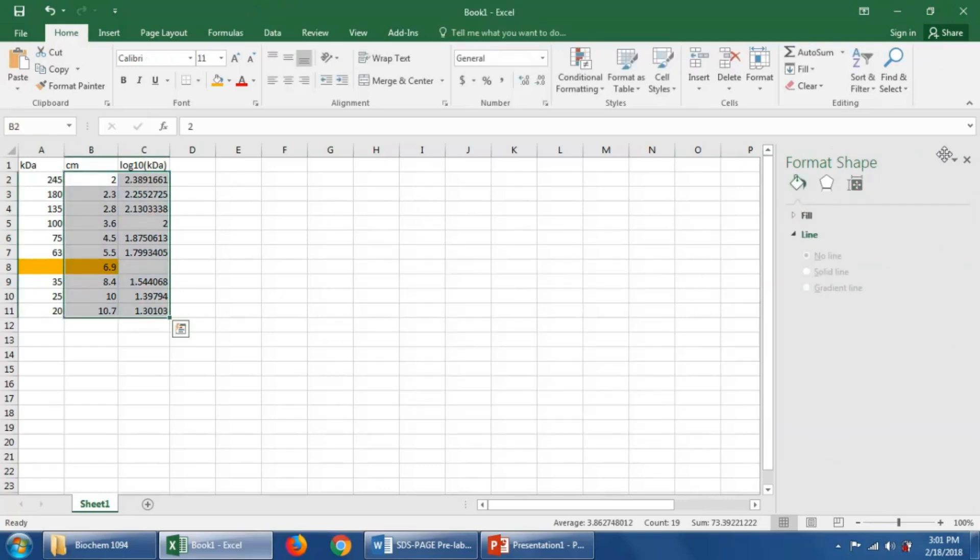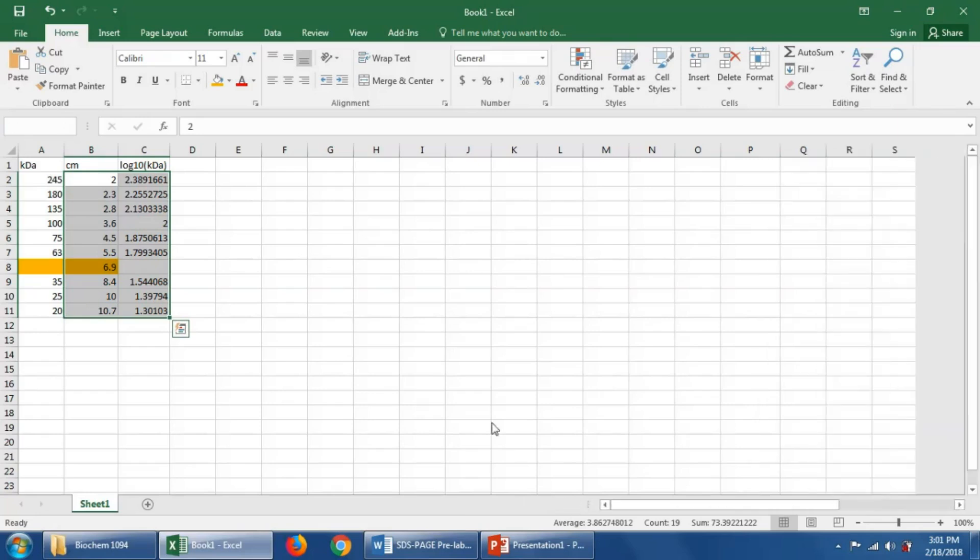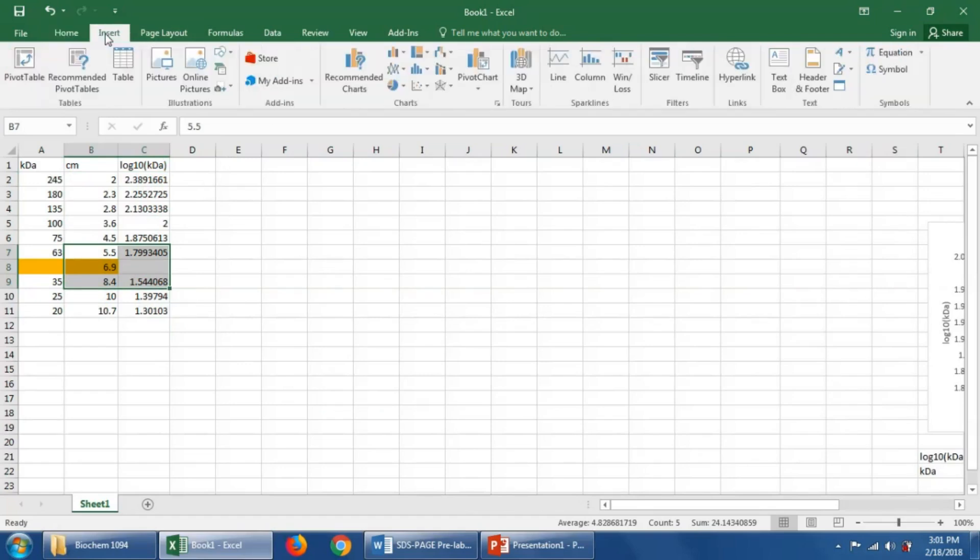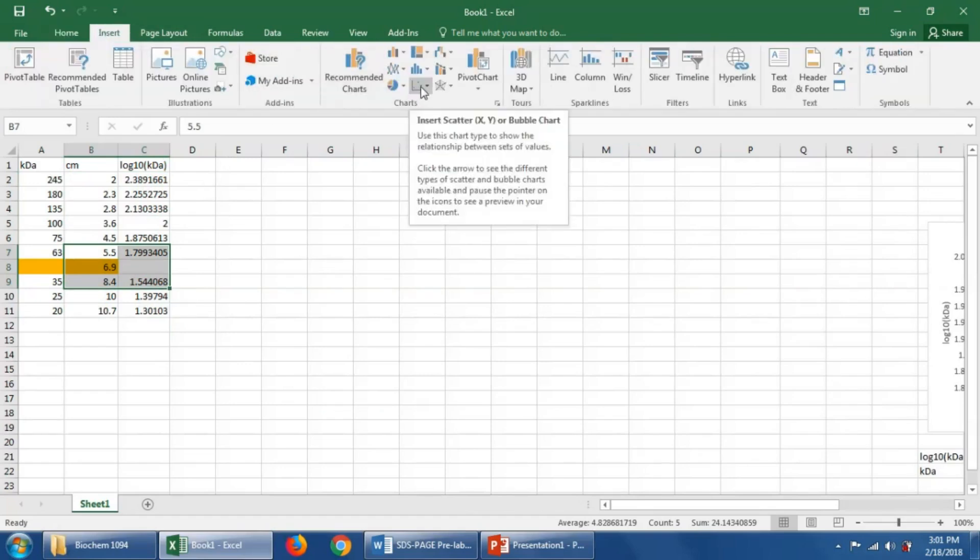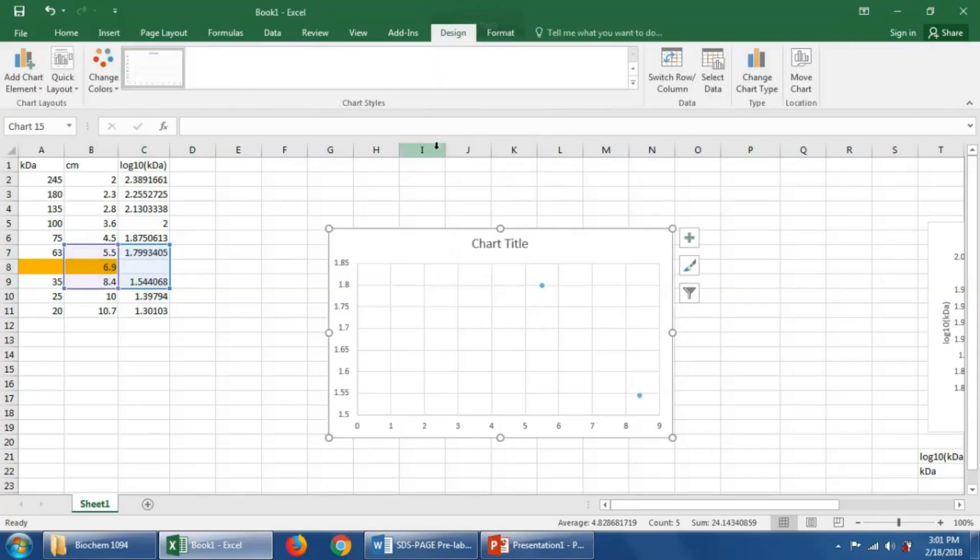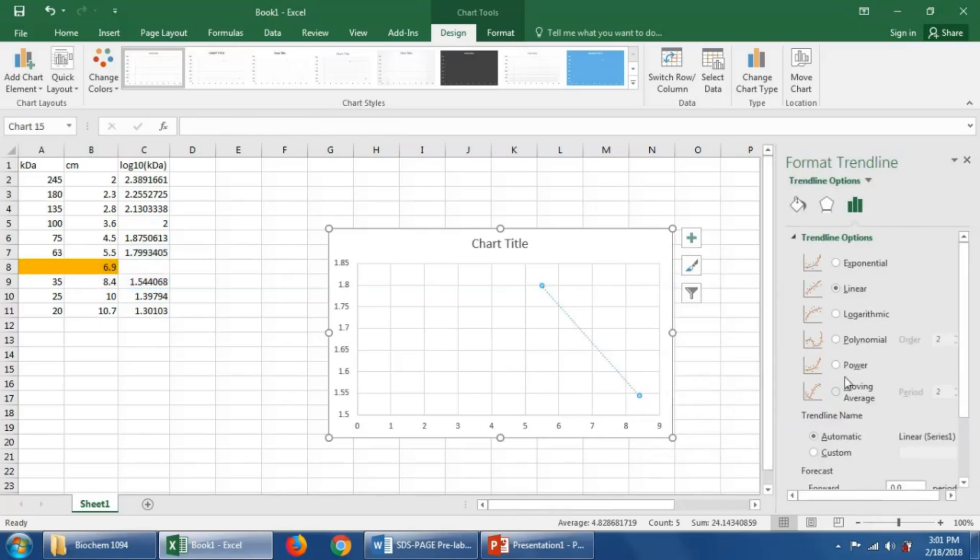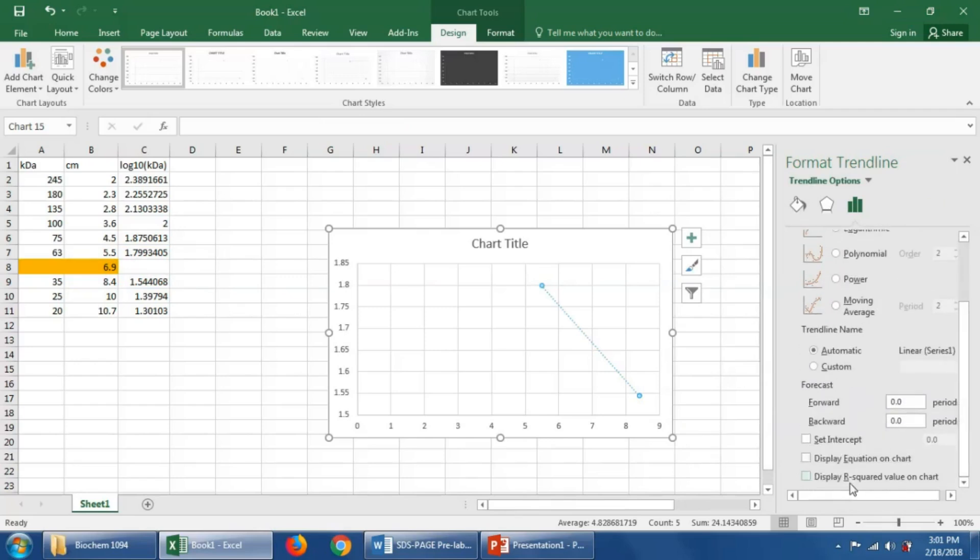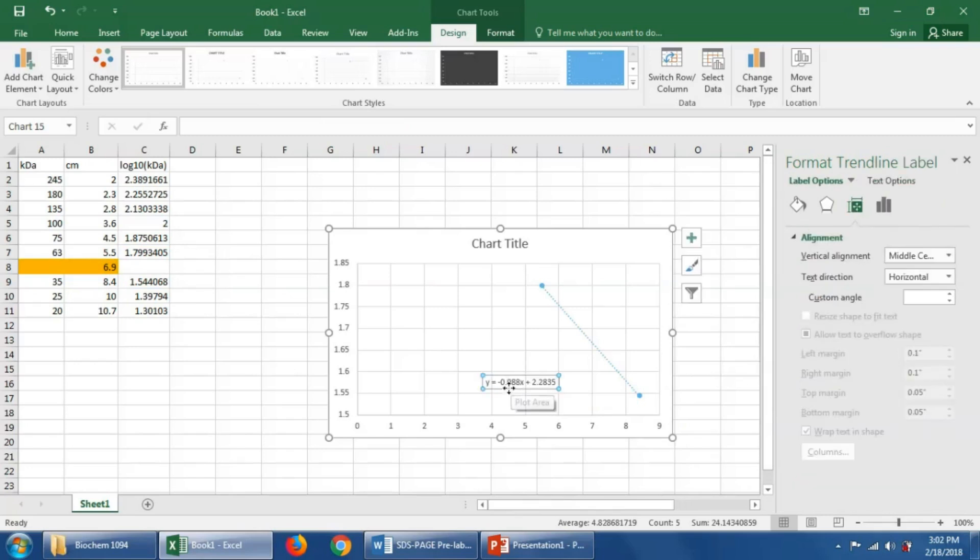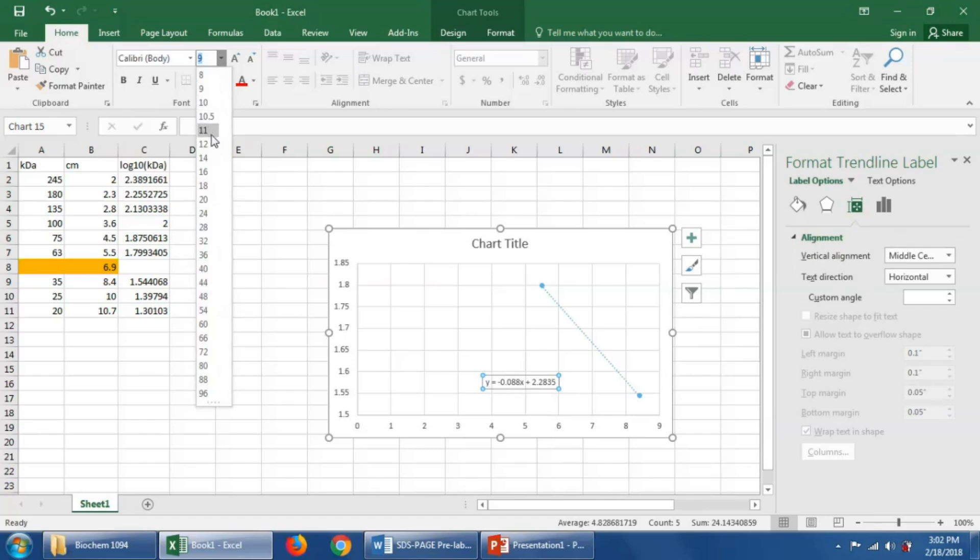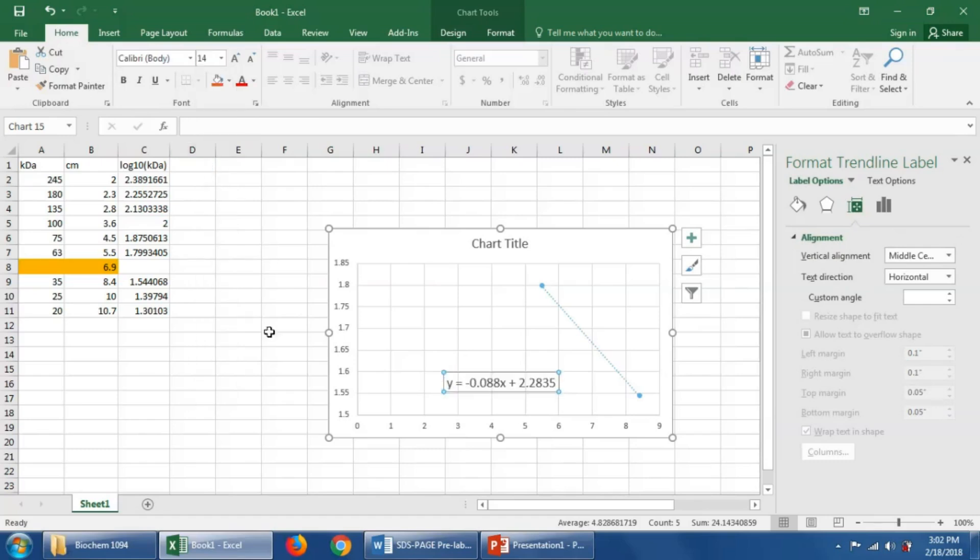Delete that. Say the same thing. We're going to go to insert, scatter plot, and now we just have two points on this graph. And 6.9 centimeters should lie in between these two points. Right click again, add a trend line. We want it to be linear. We can display the equation on the chart. I can make that bigger so you can definitely see this in your video. Now we can use this equation.